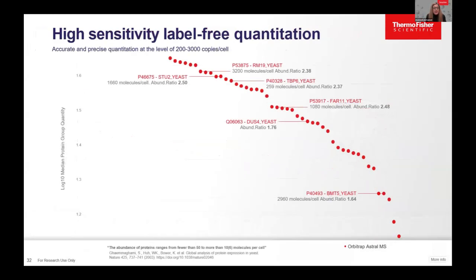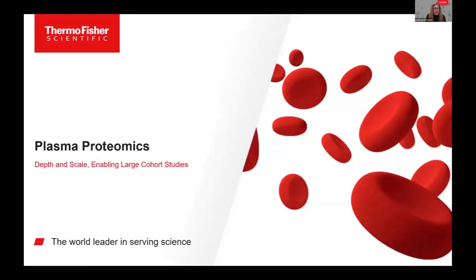And if you look at what those proteins are, some of them are actually at really low copy expression level in the cell, and you can even see them at that low copy with a really good 1.64 versus 2-fold ratio change. Really good, accurate.